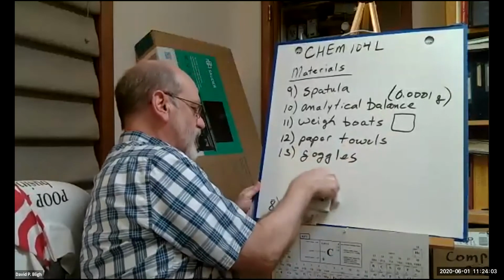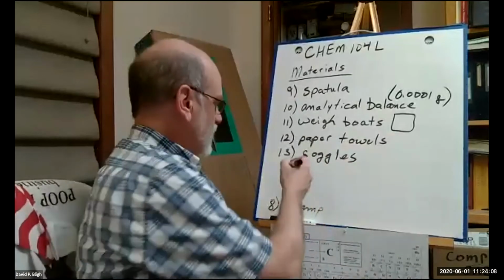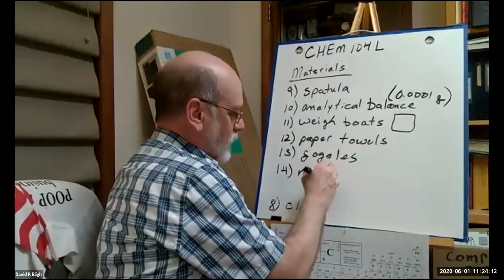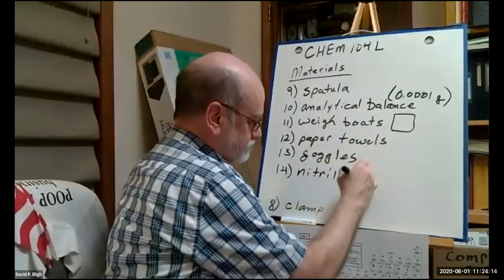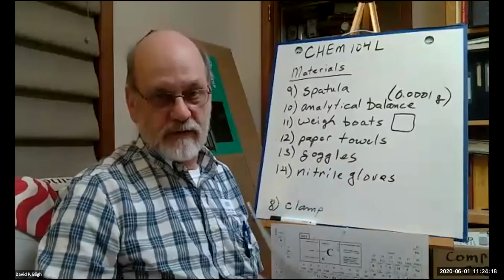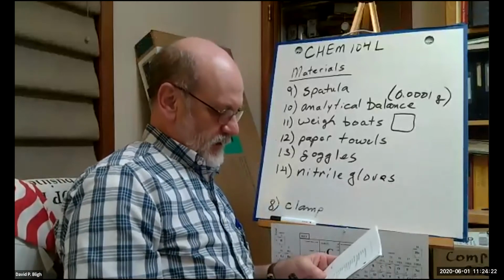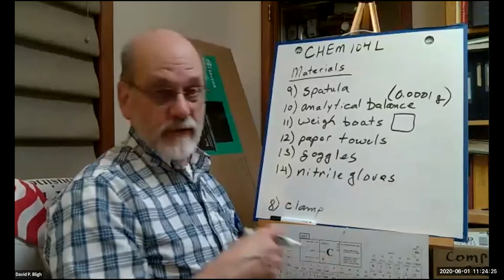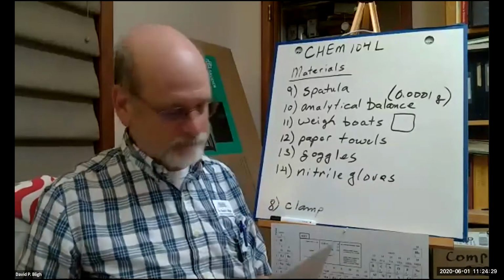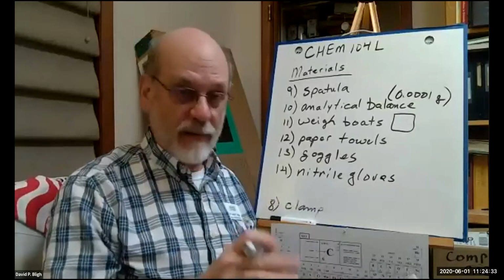Well, the goggles are provided by the lab, unless you have your own, and definitely the gloves. We use nitrile gloves. No latex gloves, so you don't have to worry about allergies. Okay, and you'll have your lab coat. We don't provide that. You have to have that. Okay, so that's everything that you'll need to do the lab.